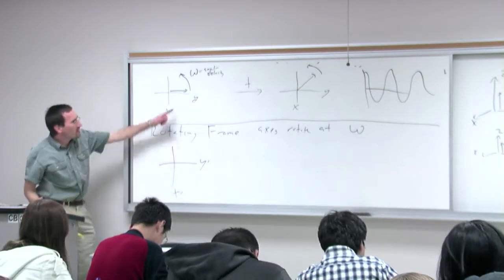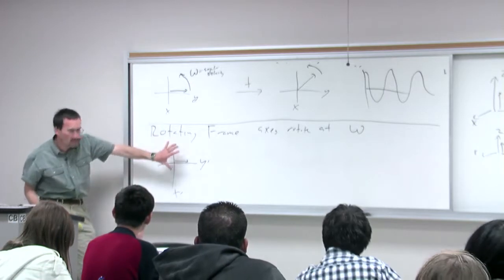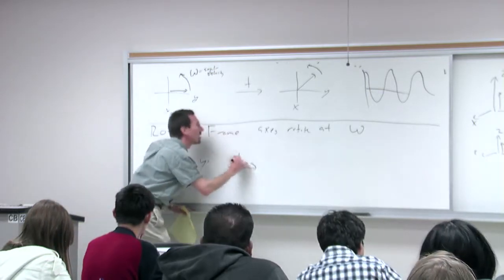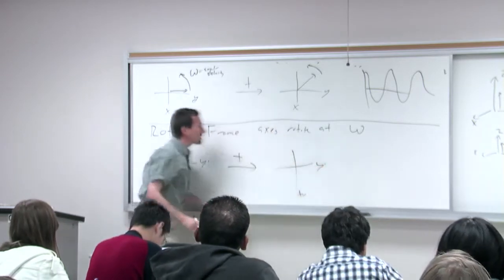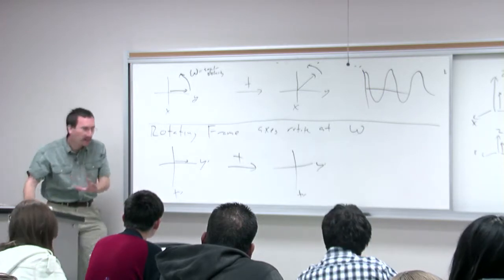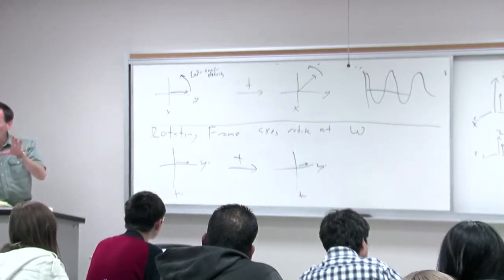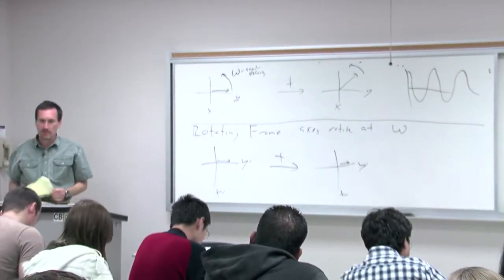So now, if you think about it, your frame of reference is rotating with angular velocity omega, and we wait time t. From the rotating frame, how does our magnetization look at time t? Exactly the same. And that's the whole big concept of the rotating frame, is simply we adjust so we're not spinning around at 500 million times per second.